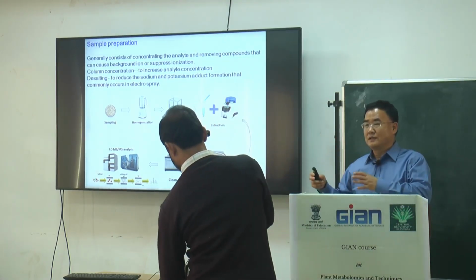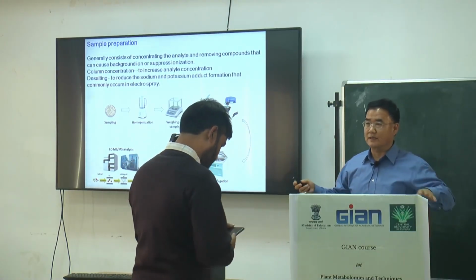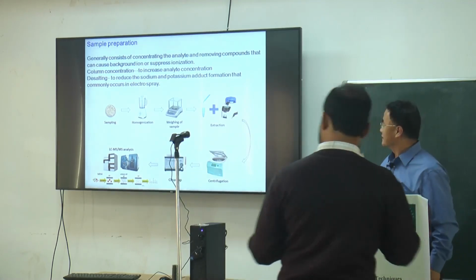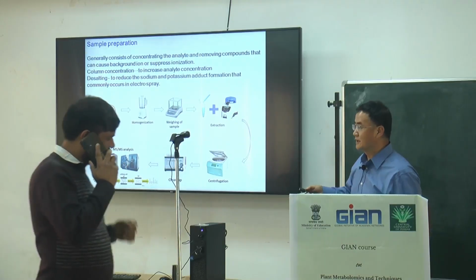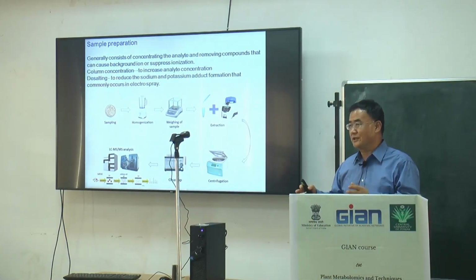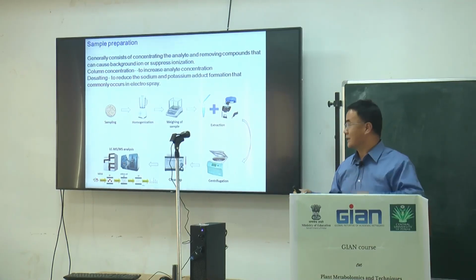Those molecules are much more complicated than the other small hormones or the flavonoids. So now LCMS and GCMS continue to expand their methodologies to apply to other areas. GCMS even has limitations.